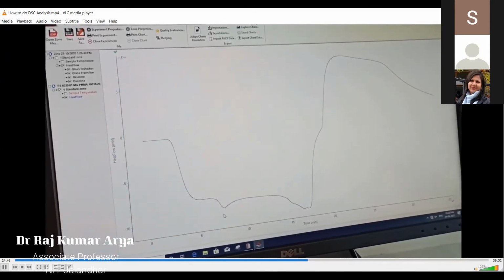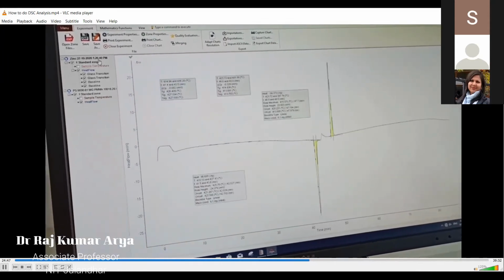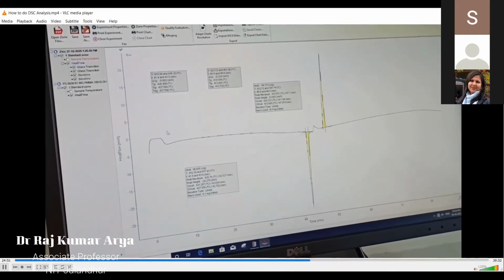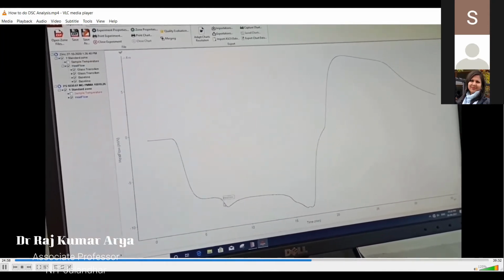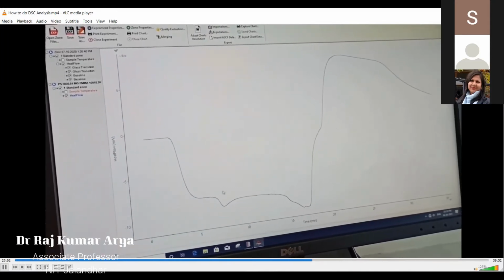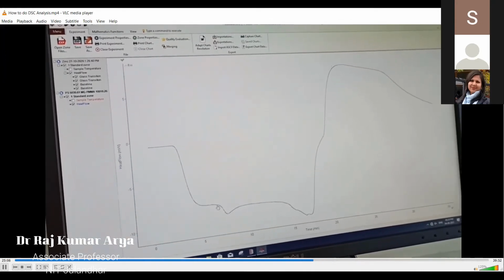Those come only in case of solid material where there was completely a sharp peak. So let's say you can have zinc one, you can see how the peaks are completely a sharp change. Now you see for this side there is no such peak, the change is from here, but not abrupt. So in that case also you can find your TG, just the same procedure.